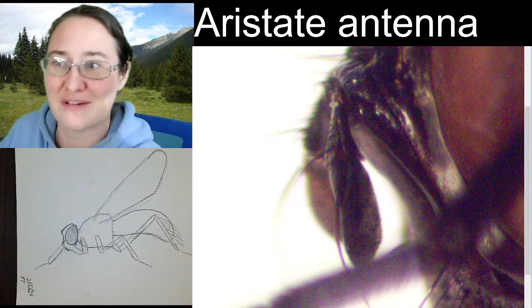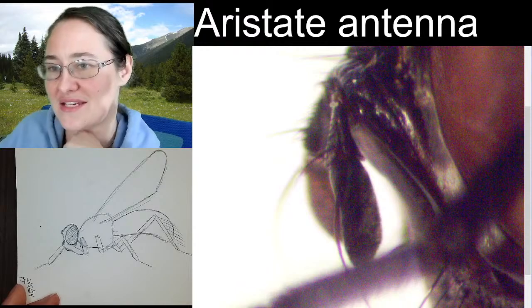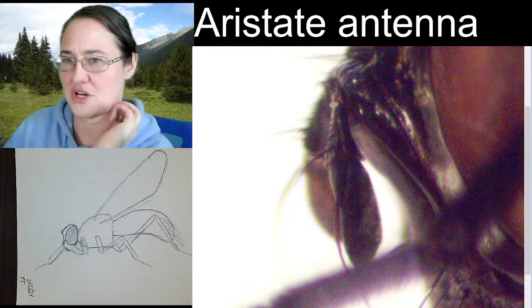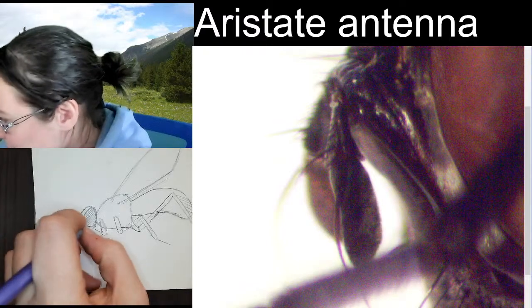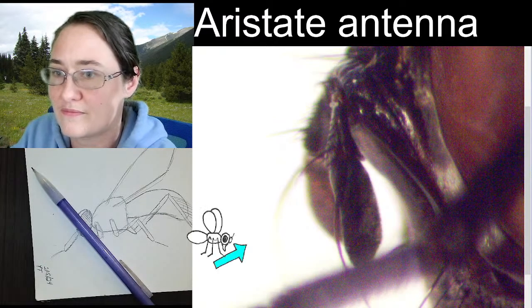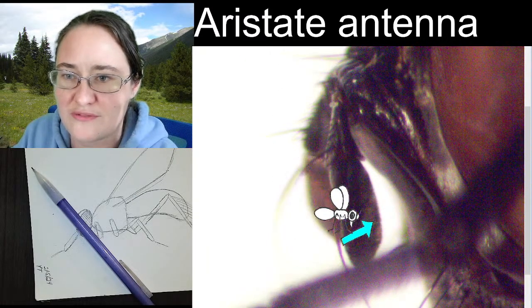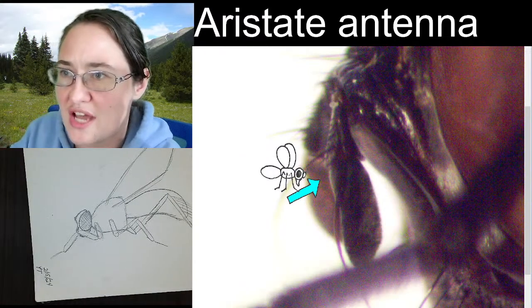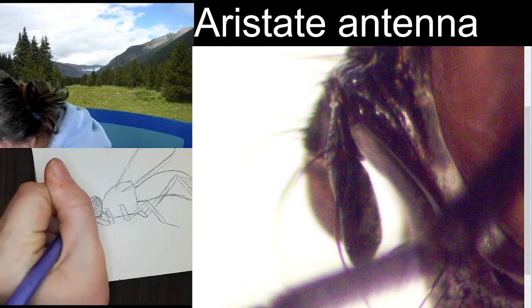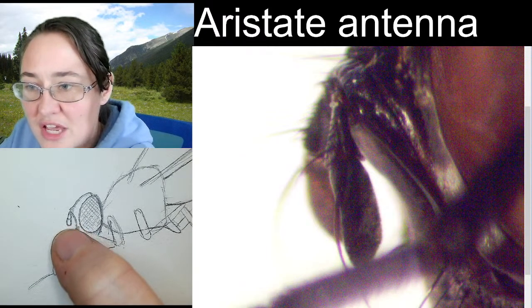Just because they're kind of round and bulbous and they just kind of hang there in the front of the head. These aristate antennae just kind of hang down. I don't know if I've ever seen them actually move forward and do this type of thing. But they're kind of fun. You can see that there are just the two segments. There's this segment here that's kind of triangular, and then there's this one that's fairly bulbous. So we just have the two segmented aristate antenna here. One little triangular segment, one little round segment.